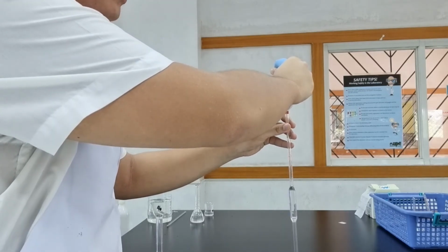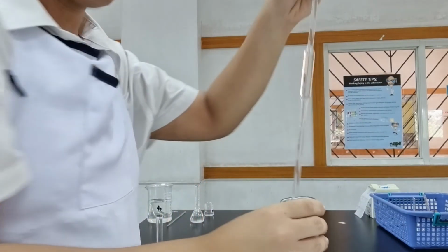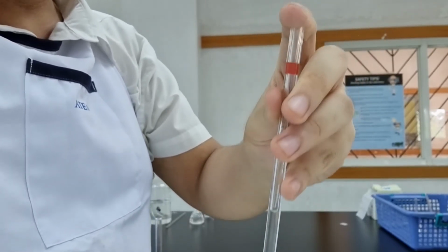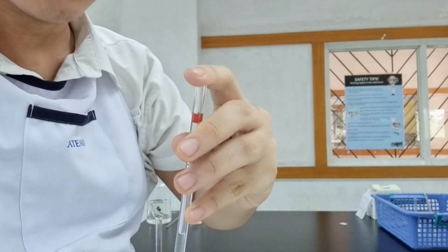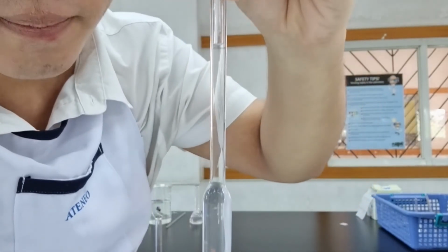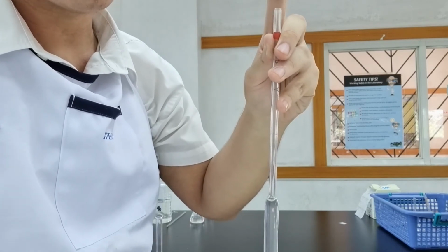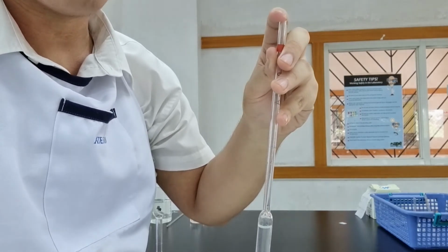I need to get liquid beyond the mark. So, as you can see, the meniscus is well above the mark. I'm now going to roll my finger covering the pipette. I'm going to do this motion. If I do that motion, the meniscus will slowly drop. The meniscus is exactly on the line. All right? Some students, they use a pipette and then they lift their fingers. That's gonna drop a lot of liquid. Again, you need to roll your fingers above the tip of the pipette.